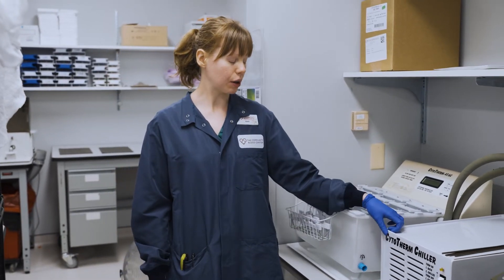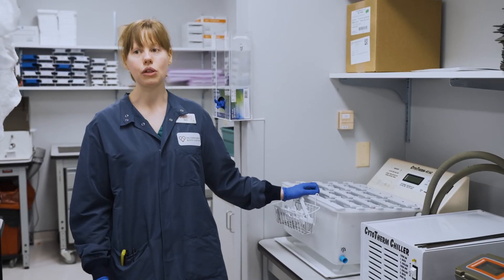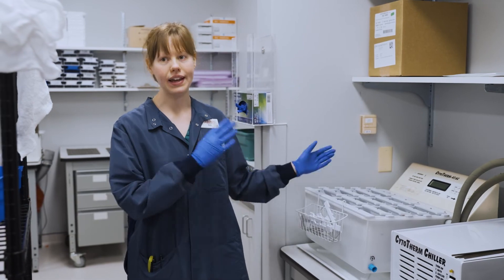This turns on with the compressor — it's actually refrigerator temperature, so the water gets pretty cold and it thaws fairly slowly. Then we take it out and process it from there.